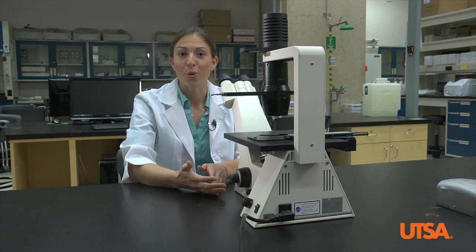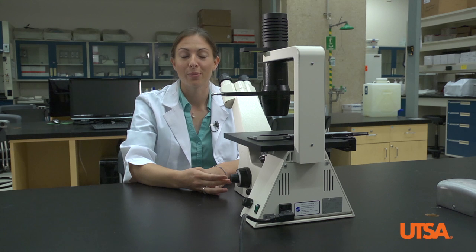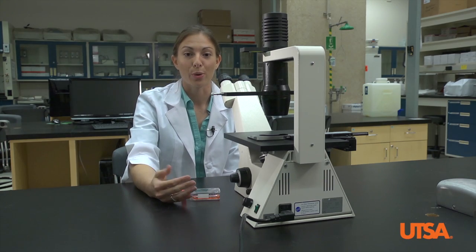The inverted microscope gets its name from the placement of the light source and the objectives. On a traditional light microscope the light is below the specimen while the objectives are above it, which requires the object to be on a thin microscope slide. However in the cell culture lab we use bulky tissue culture flasks, so we have to use an inverted microscope to give us more room.